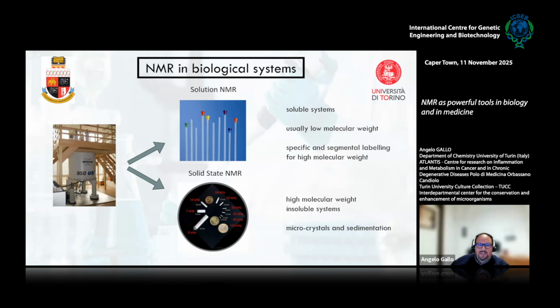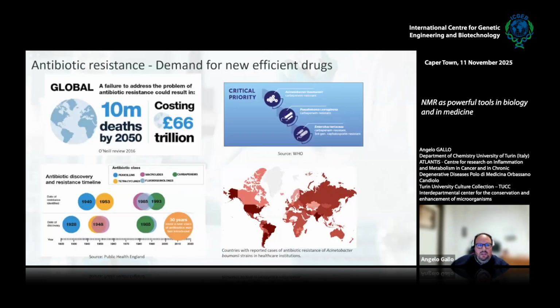For the solid state NMR side, I'm going to present some data about high molecular weight systems, typically insoluble or very poorly soluble, and the application can be run on microcrystals of these proteins and sedimentation. So let's start with the first part of the talk.